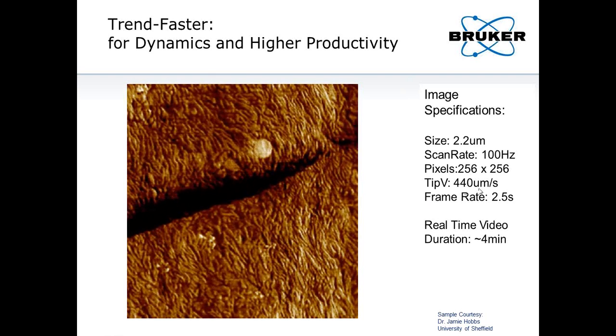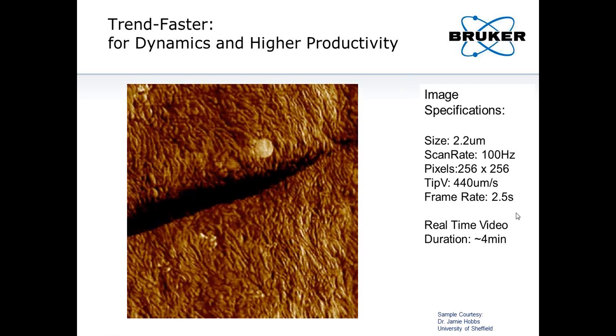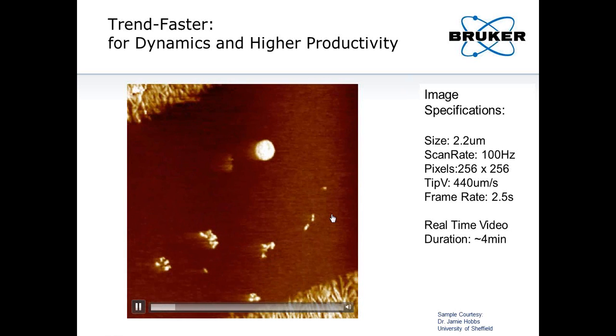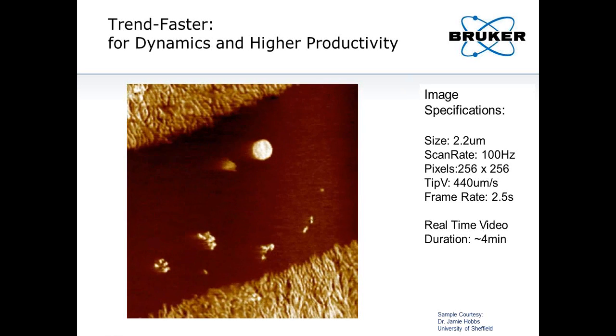So the scan rate here is 100 Hertz. For one frame, it takes a little over 2 seconds. Of course, we want it to be faster and faster. So that's one trend, to scan faster.